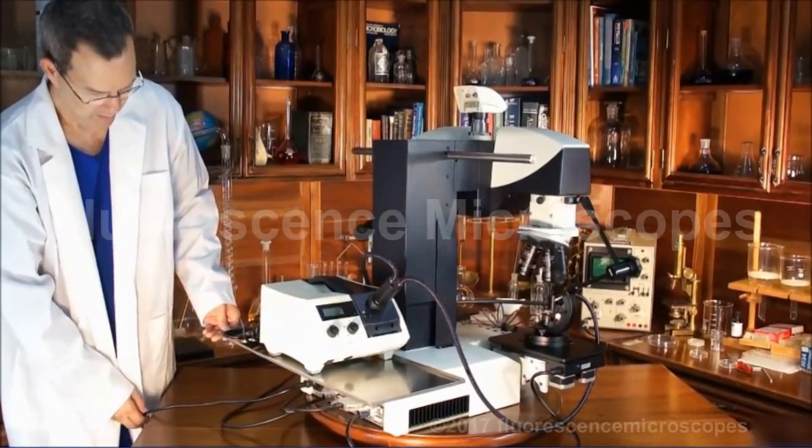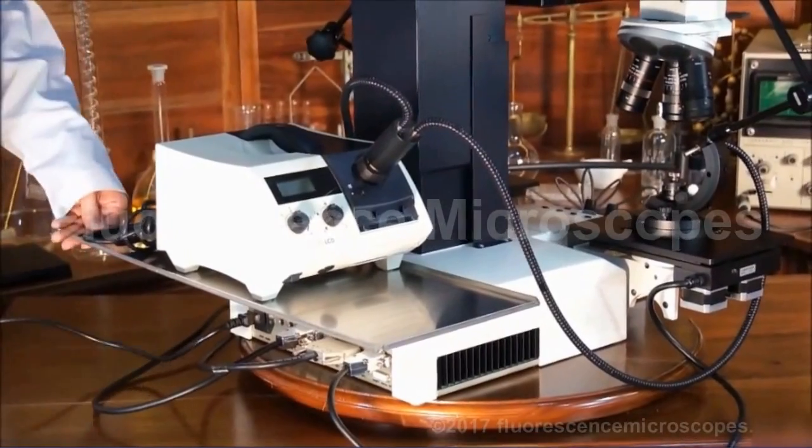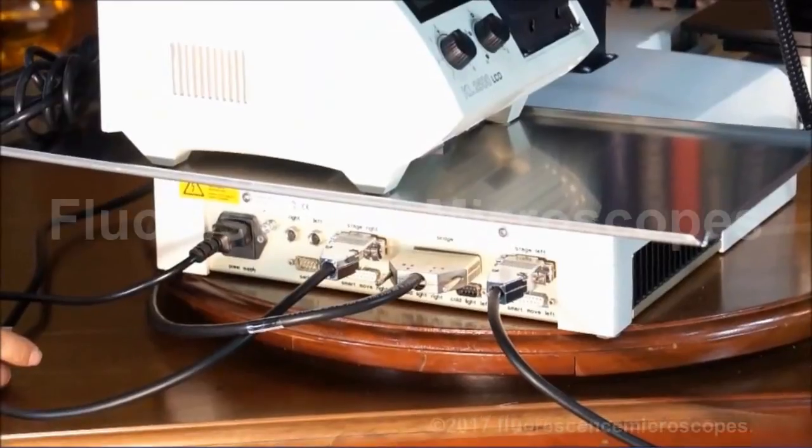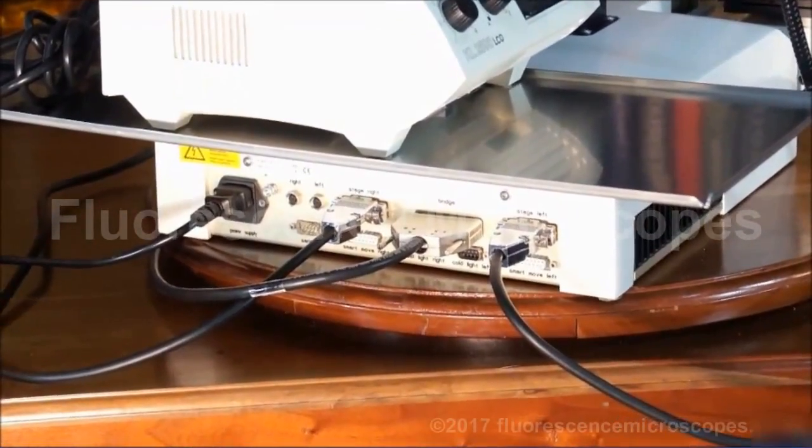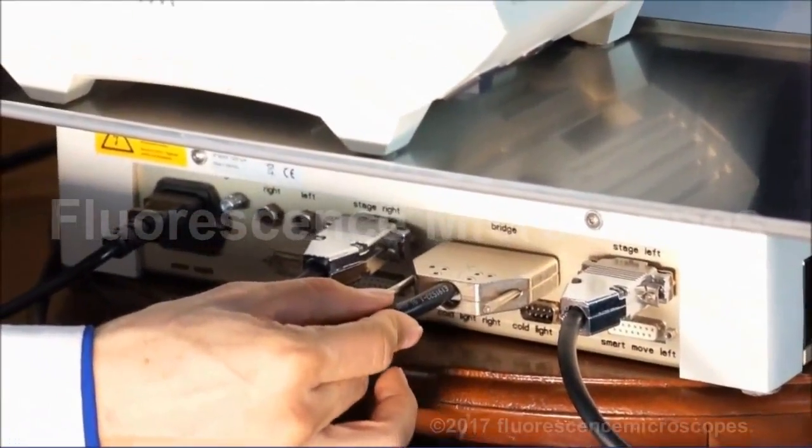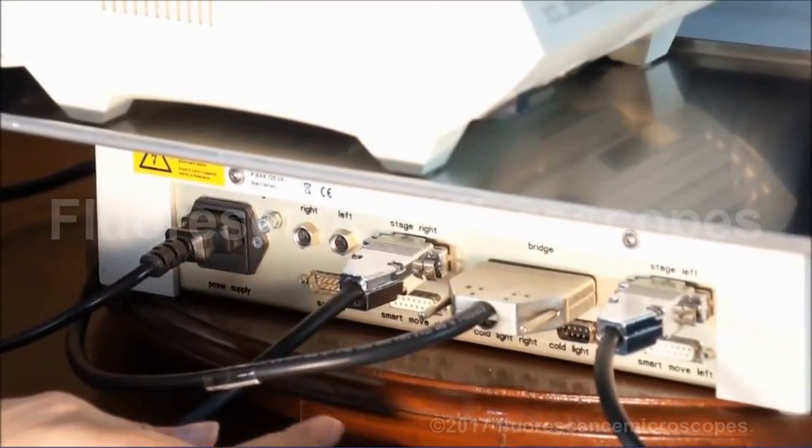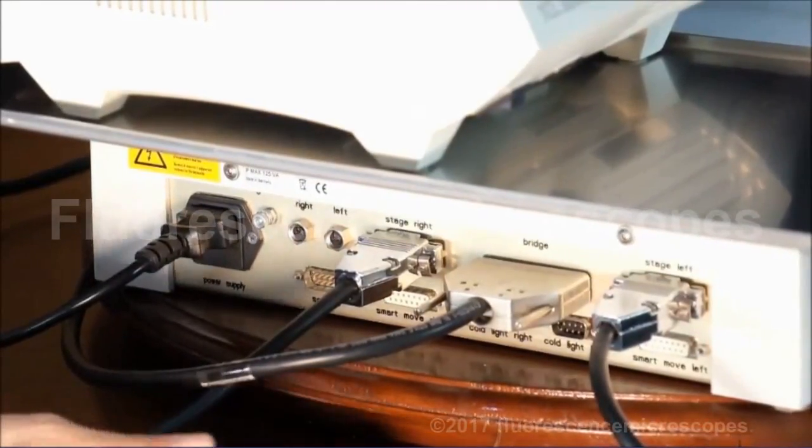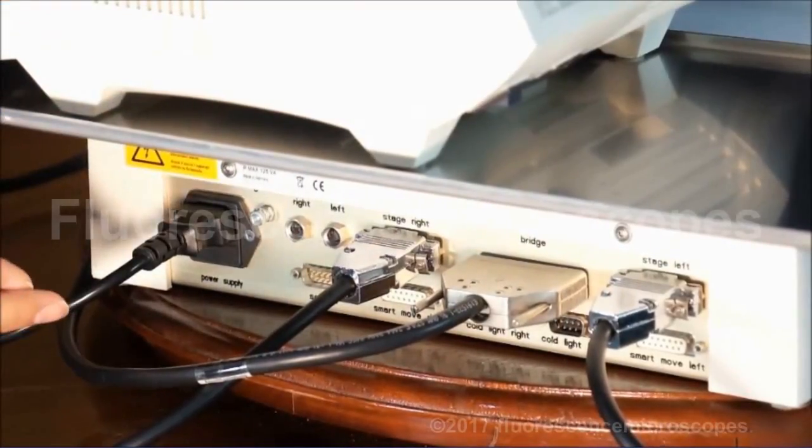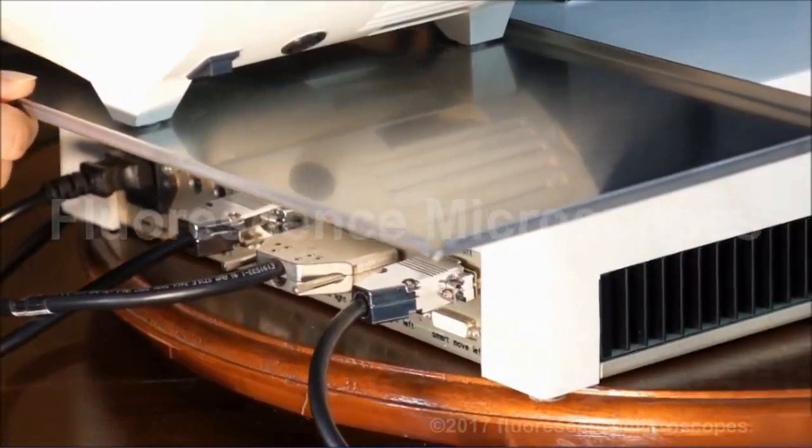This has got a lot of other connections at the back. It's got the stage right and the stage left. This controls the bridge. It's got some cold light sources, which we're not using any additional cold light sources other than this. It's got a serial port and some other fittings or connections.